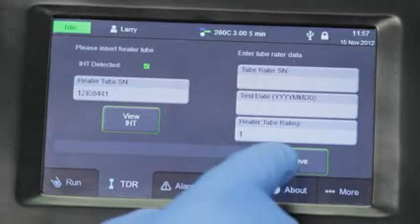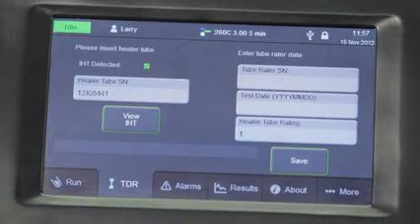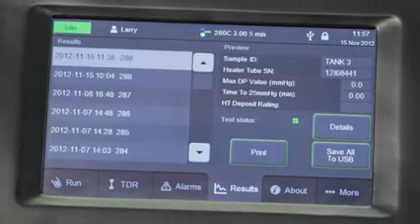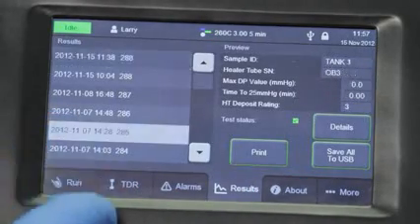To save the data onto the IHT and into the file database on the instrument, 100 tests can be saved on the unit and can also be saved on a USB drive. You can see the test results on the screen as well as print them from the results tab.